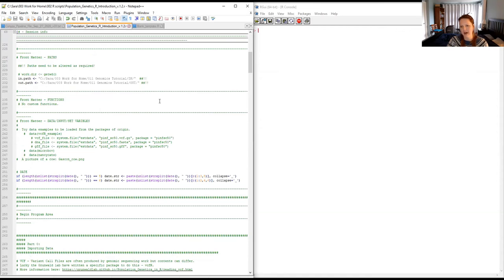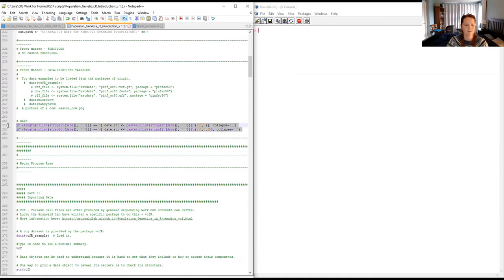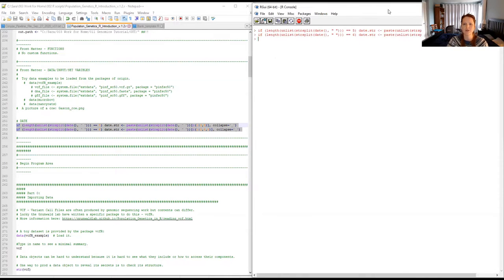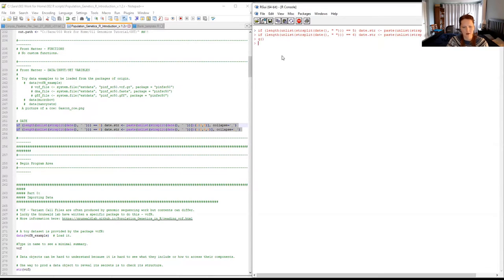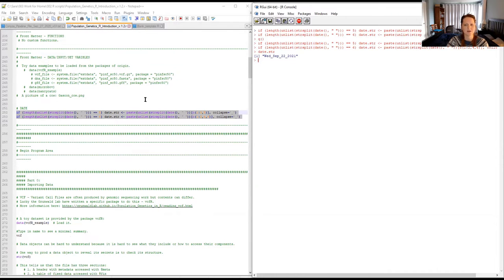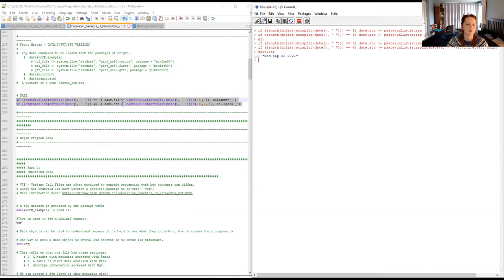Here I set my paths so they can easily change if I go between a work computer or the cluster. I also set a date string — it's a slightly complicated statement, but it helps set the date to the current date and you can use it as a variable when producing files. That way you know when the file was produced, and if you do it dynamically, it's a lot easier than having to remember to rename your file every time.